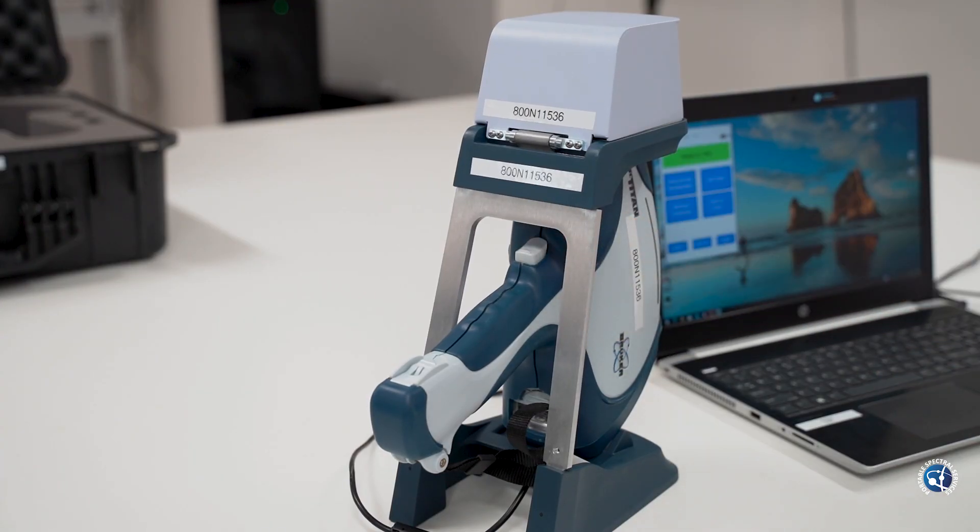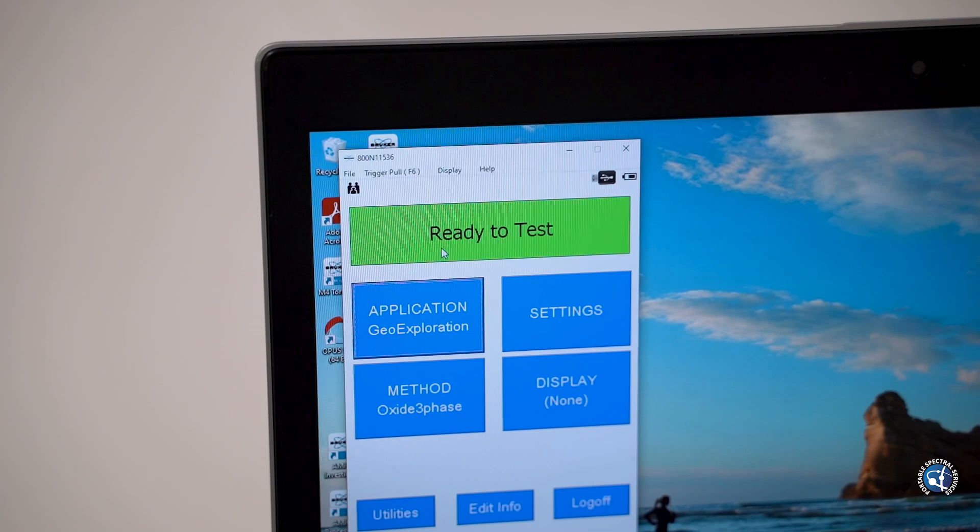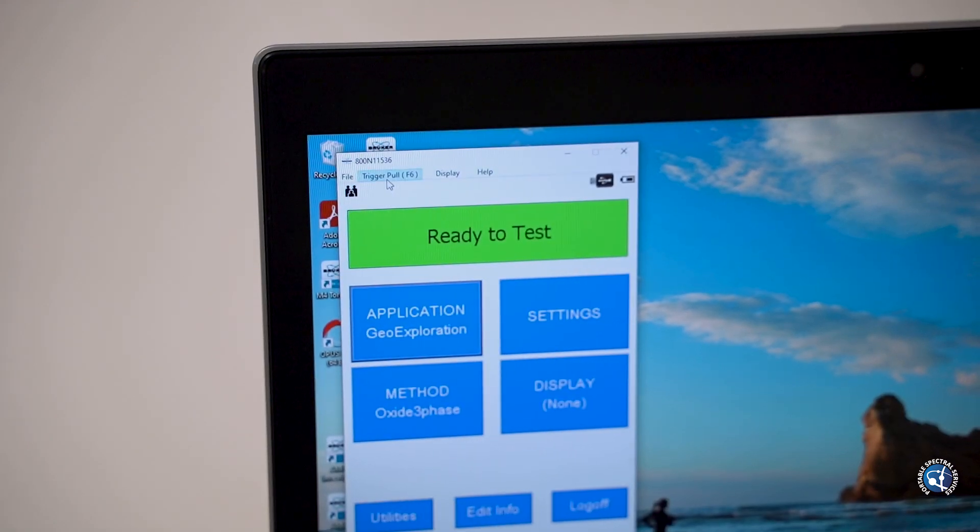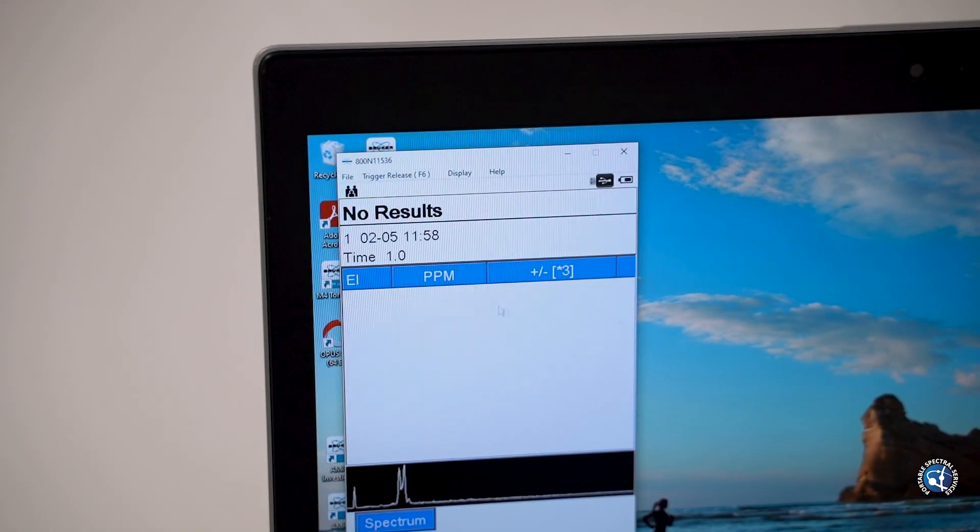If you're using Bruker remote control software, press trigger pull. To stop analysis early, pull and release the trigger again.